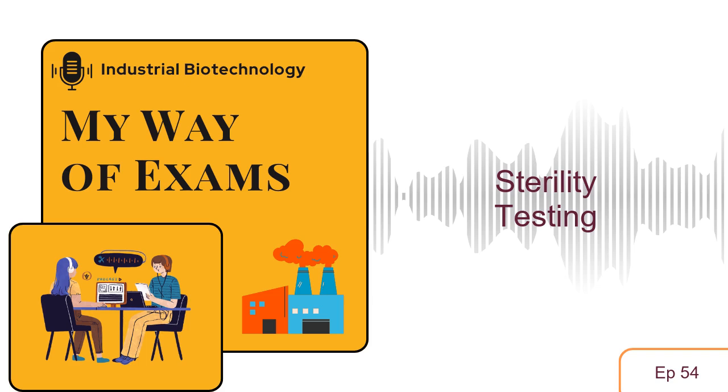Okay, so two different broths. Two different broths, two different environments. The FTM is great because it can grow both aerobic and anaerobic bacteria. So that covers a wider range of potential contaminants. Anaerobic, meaning they don't like oxygen or they can live without it. Exactly. And then both of these broths with the membrane are incubated. They're just left to sit. They're kept at specific temperatures. The TSB is a bit cooler, kind of like room temperature. But the FTM is kept a little warmer, more like body temperature, for at least 2 weeks.